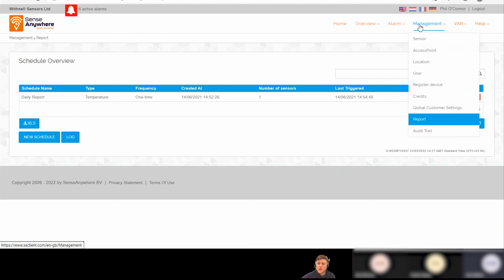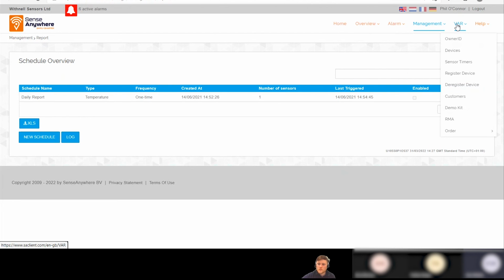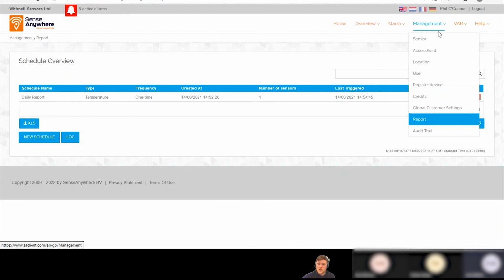That's available. Yeah, if you could possibly send that over as well, so you can see what it was like. As I said, I haven't had a chance to play with it, so maybe I can see that myself when I get around to having a look at it. Of course, that's fine, no problem at all.